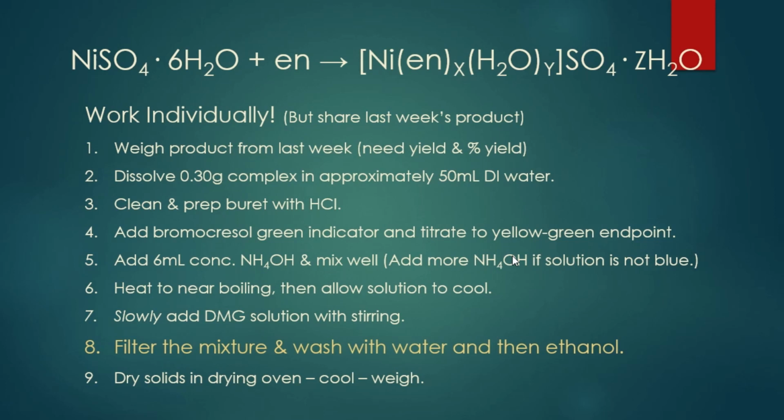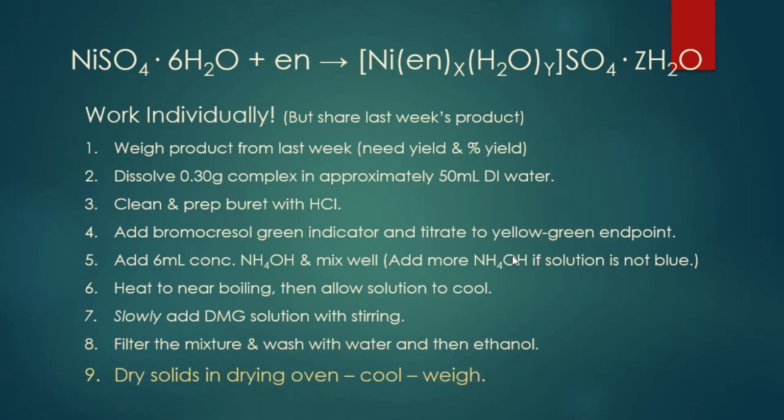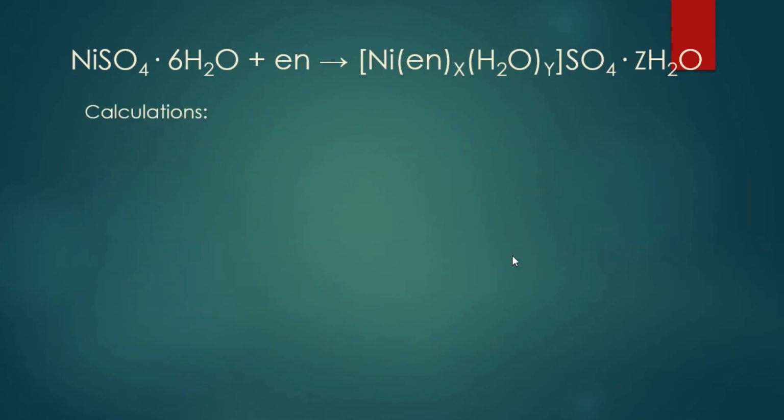Most of this won't take too long. You'll probably be a little slower with the titration than I was. You'll want to be careful with it. When you've done a few of them, you can go more quickly. But it still doesn't take that long. Making the DMG, you've got the heating period. That's going to be a little bit, and we've got a lot of calculations to talk through, so don't get ready to run yet. So we are going to be finishing up. It will take a good part of the period, especially with that 10-15 minute heating.